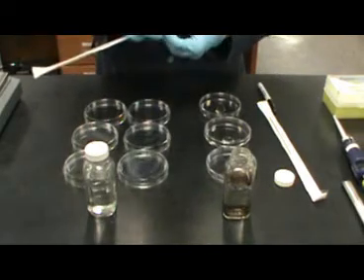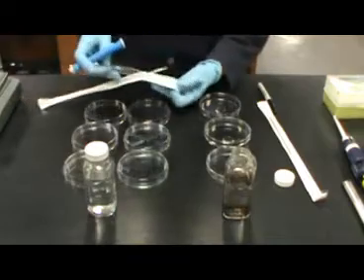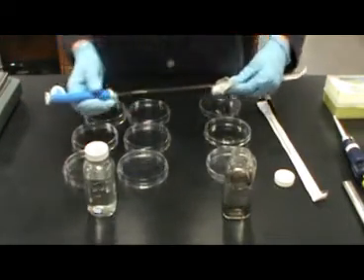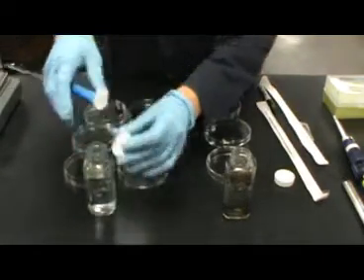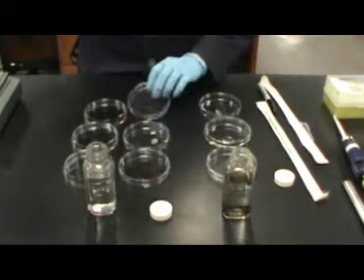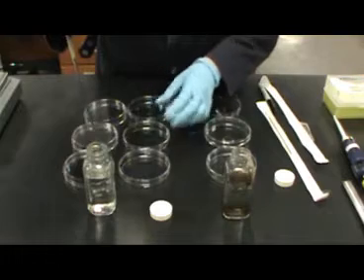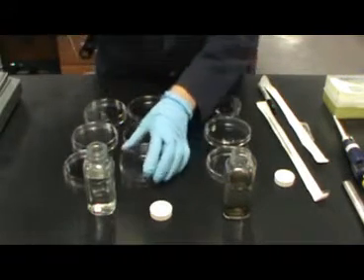Using a new pipette, you will now begin adding 1 milliliter of your 10 to the negative 4 dilution to the second column of plates. The same procedure will be used for this as was used for the 10 to the negative 2. Remove 1 ml and place it in the center of the plate.